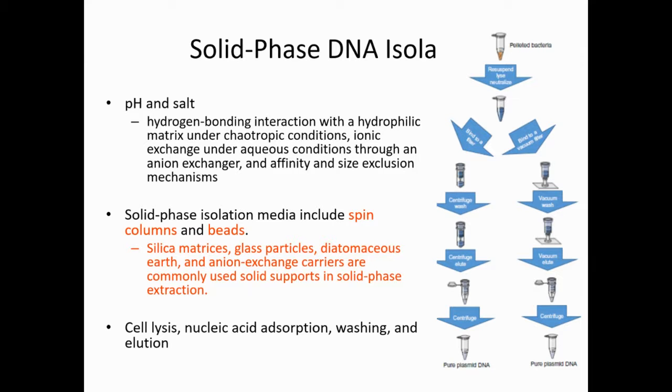It's useful for the purification of plasmid and DNA by immobilizing the DNA onto its particles in the presence of a chaotropic agent. A chaotropic agent basically is a molecule that can disrupt non-covalent bonds in general. And the famous chaotropic agent is urea or guanidine.